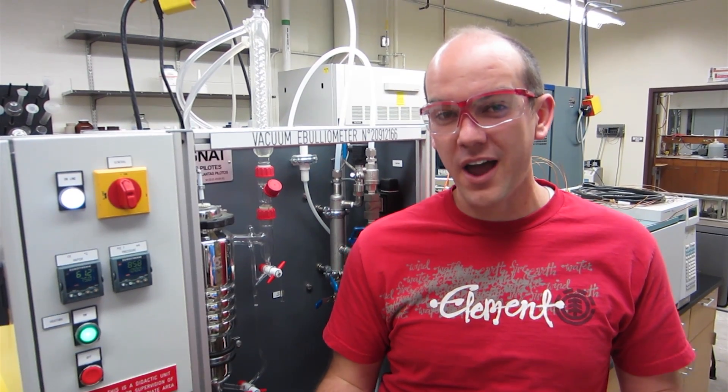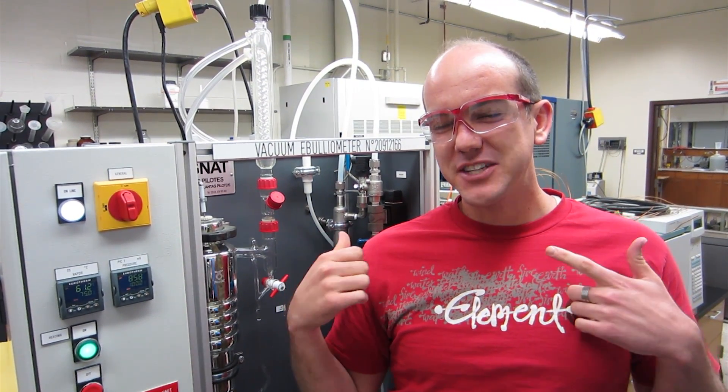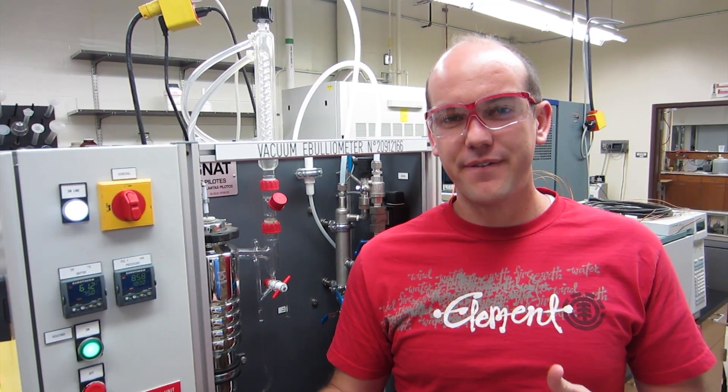Okay, here we got the ebulliometer. It's generally used to measure the alcohol content in wine. We're not going to do that in your lab. What we're doing is using it to measure the vapor liquid equilibrium data for ethanol and cyclohexane.